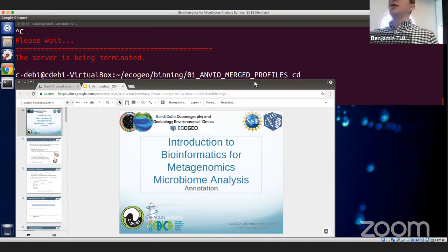I'm going to start right here because I know JP is going to ask me this when we get a little further into it. It's going to be the question of how do you know you've perfectly annotated your data? And I'm going to tell you right now, you don't know. I'm spoiling the surprise at the end of this. It's not on the first slide, but maybe it should be, which is that annotation is a hard process, right? There's a lot that goes into this and a lot of assumptions that happen. And there's a lot of room for error.